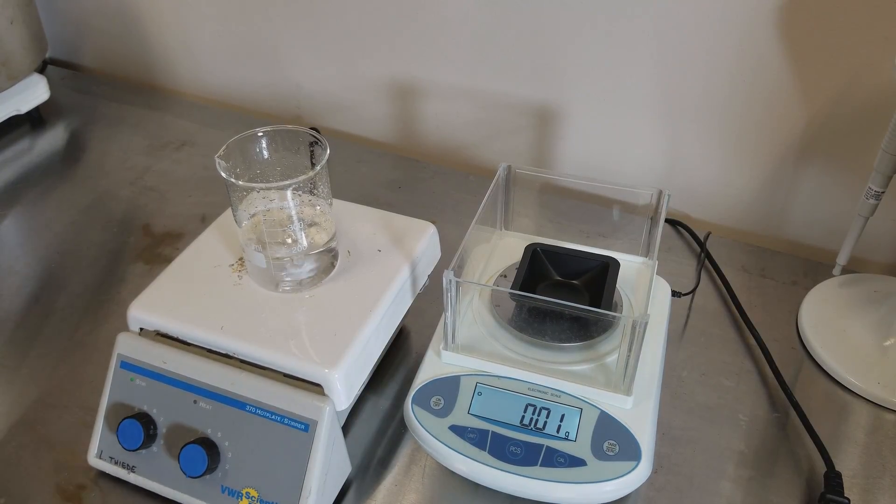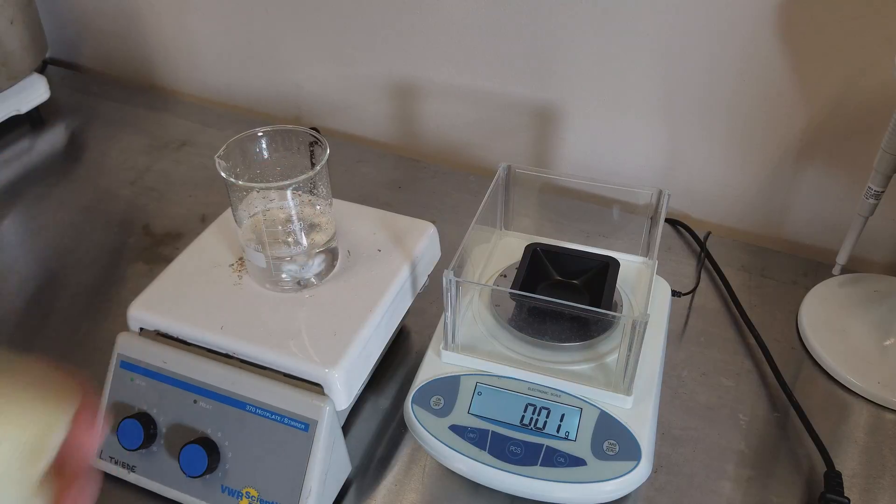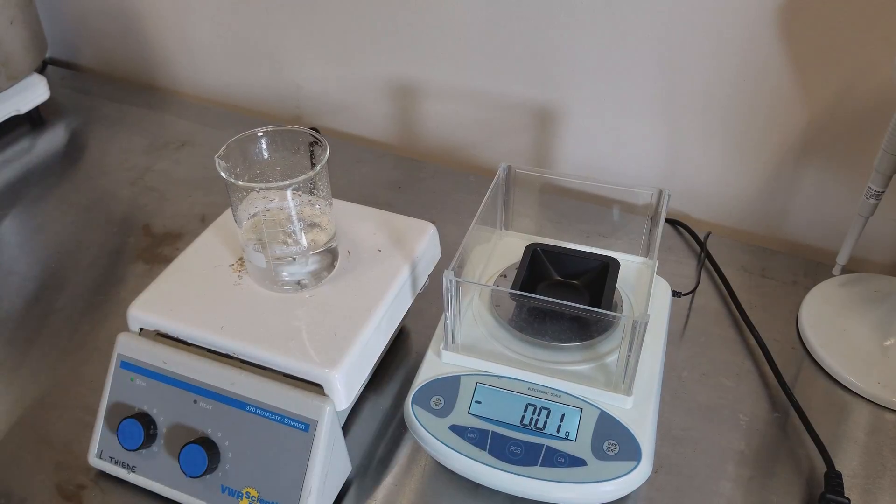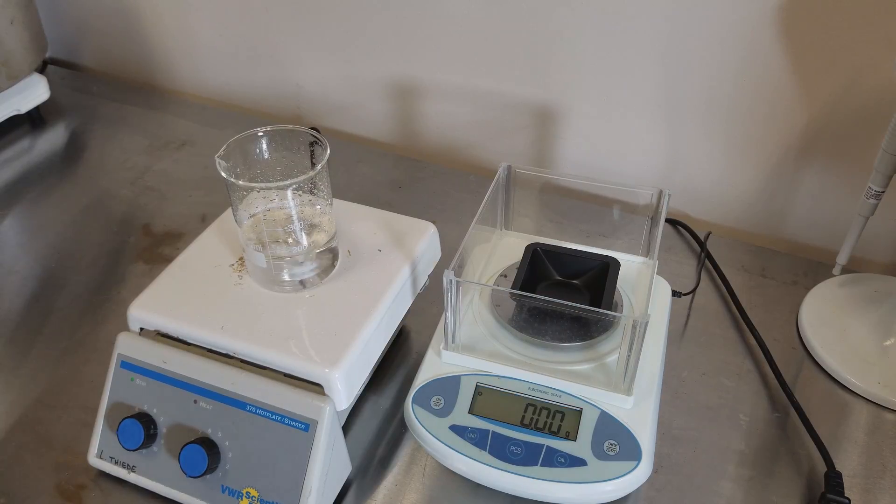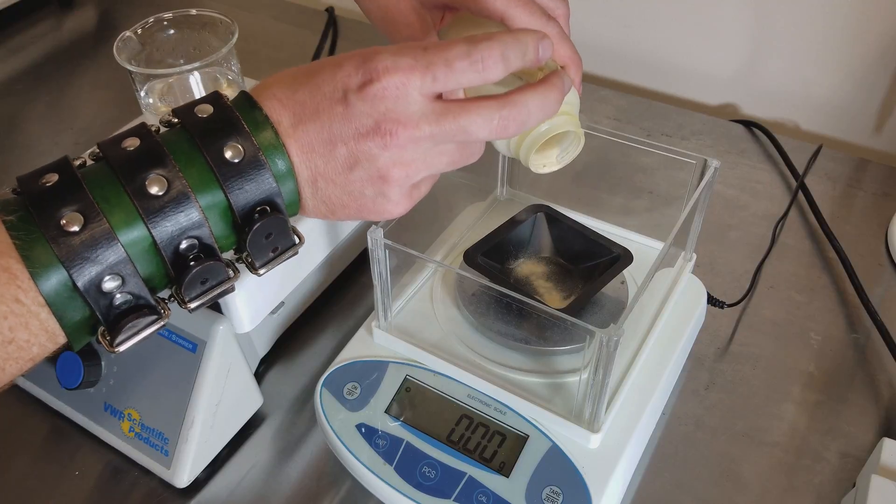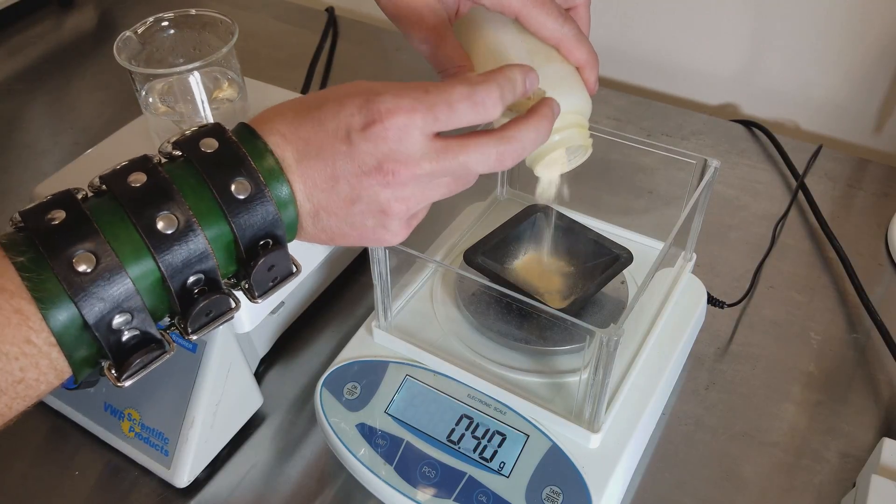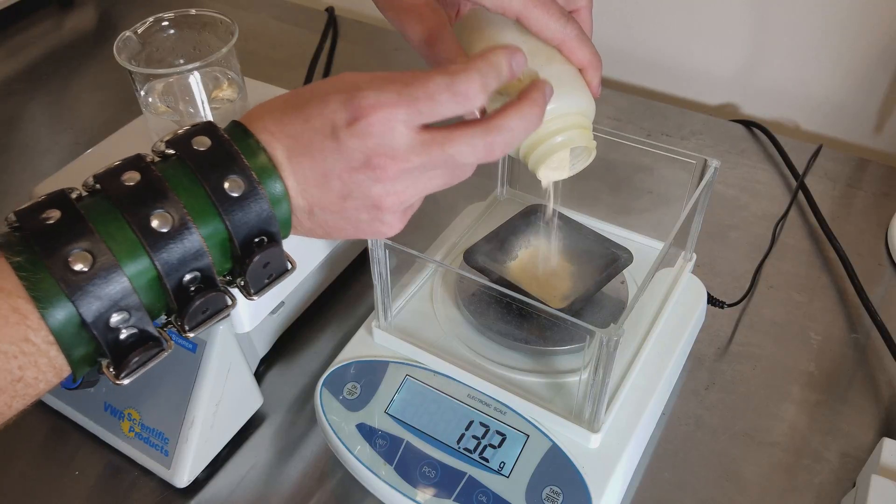The first thing we're going to do is 2.5 grams of tryptone. What I always do is I just slowly tap out 2.5 grams.